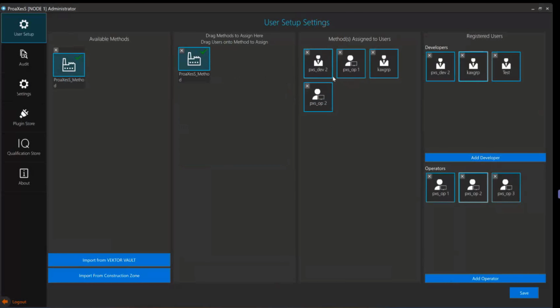Developers can run in sandbox or GMP mode. They might want to test the method in GMP mode, so they can set that up, or they might want to fix the method, develop it more. So they can run in both. So let's just log in as both.